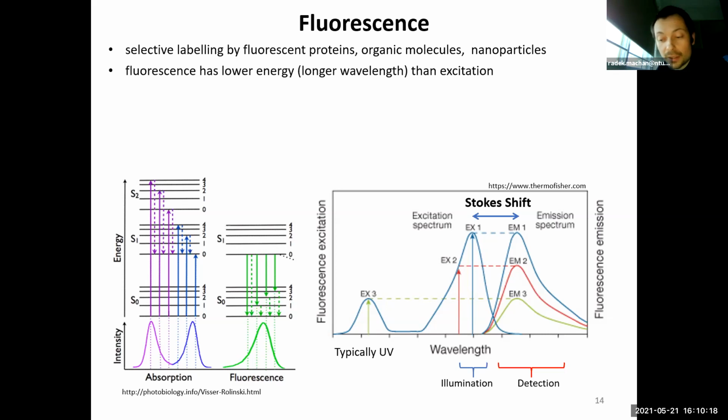And another thing that is very important is that fluorescence saturates, because the molecules always spend some non-zero time at this state, at the lowest vibrational level of S1. The time is typically quite short, some nanoseconds, but it is a non-zero time.